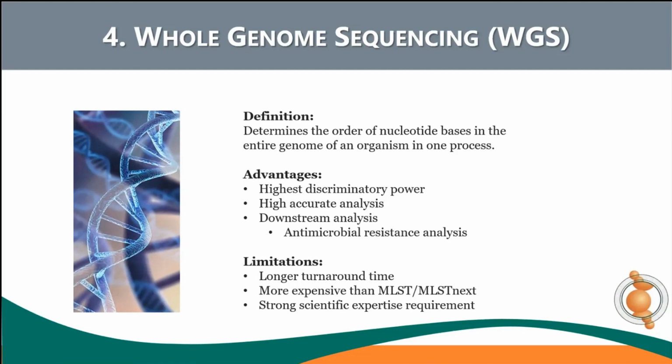But whole genome sequencing has a longer turnaround time, it's more expensive, and it also requires strong scientific expertise to conduct the analysis. So this limits the use of whole genome sequencing for genotyping and pathogen tracking on the food processing side.